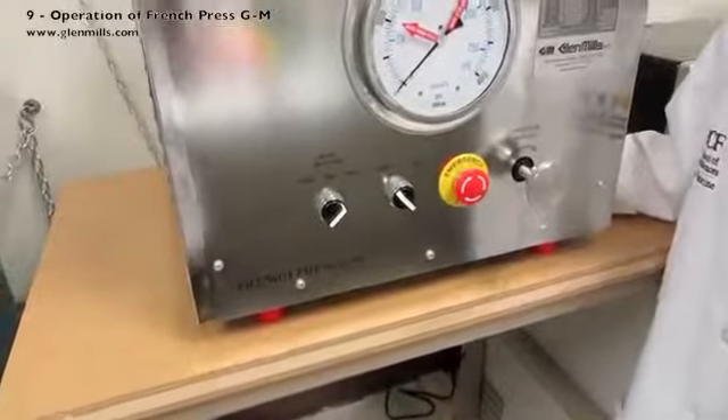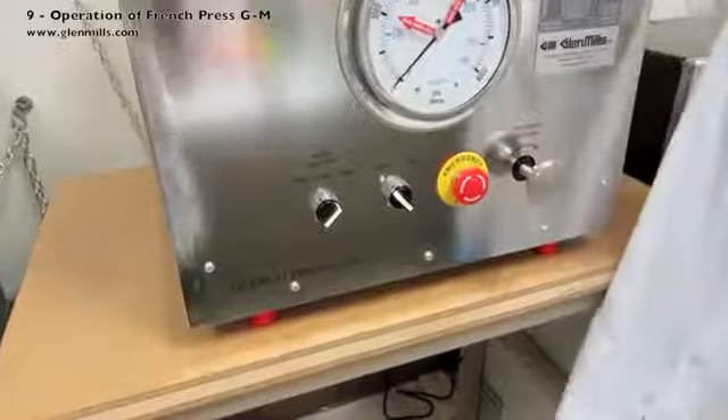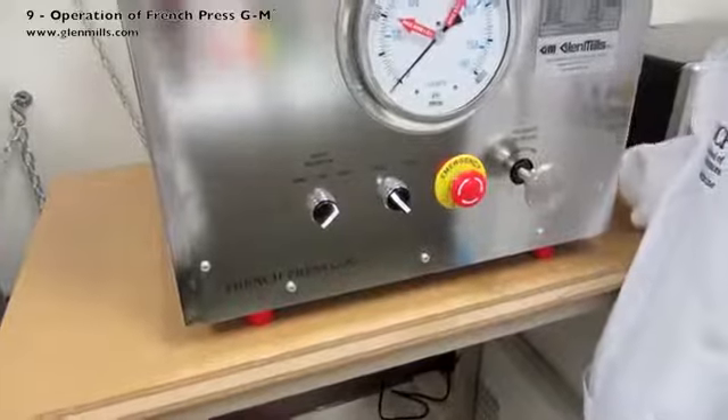This is the setting used with the 1-inch standard pressure cell only. This high setting is not used with the mini cell.